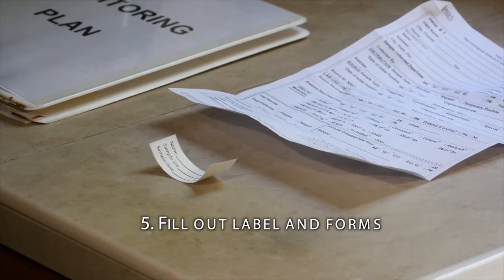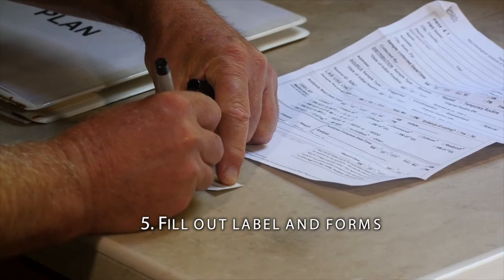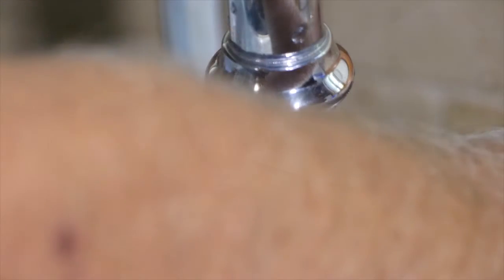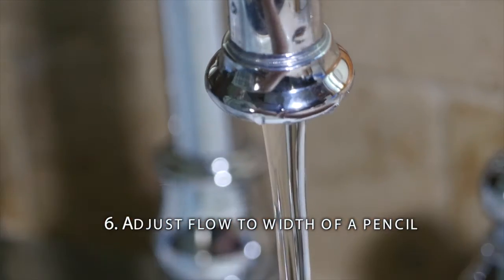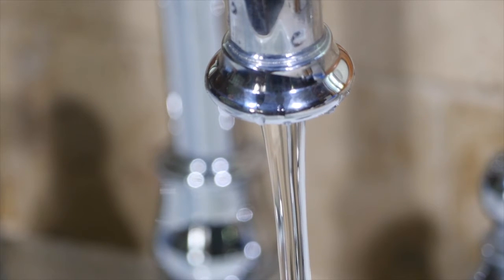Fill out the label and all other forms. Be careful to use waterproof ink and write clearly. Adjust the flow from the tap to the width of a pencil. You want a steady, controlled flow that will not wash the dechlorination powder from the sample bottle or splash water from the sink into the bottle. Don't change the flow once you start sampling because this could dislodge microbial growth from the plumbing.